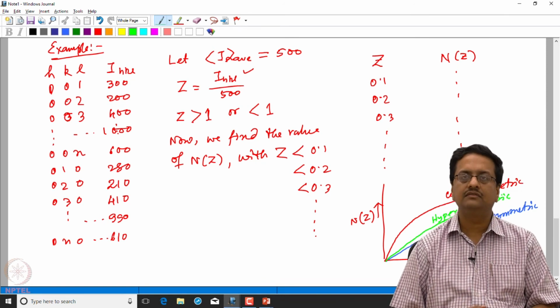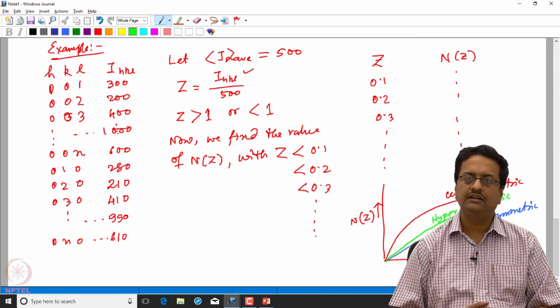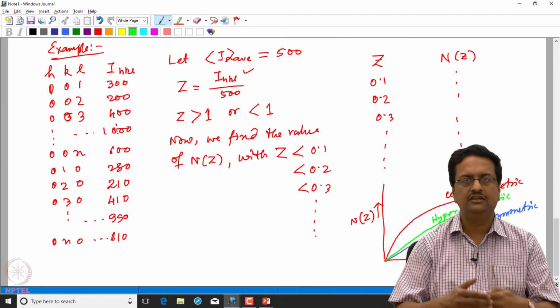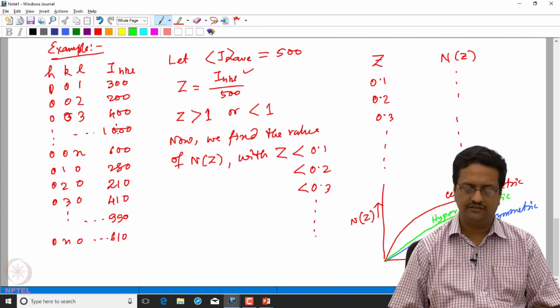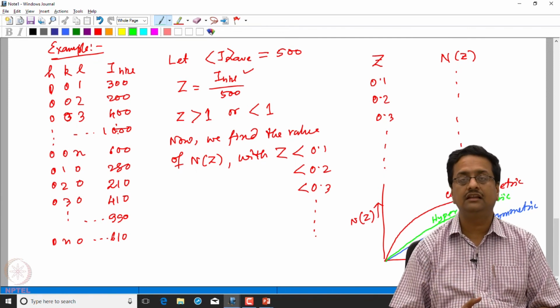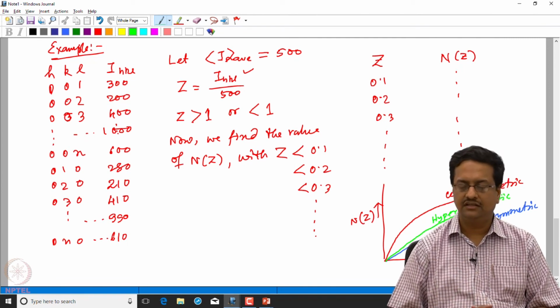So, in this lecture, we have learned how to identify from the intensity statistics the correct unit cell parameters, how to identify the correct Bravais lattice, that is the correct crystal system, whether it is monoclinic, orthorhombic or tetragonal or anything of higher symmetry, and then we tried to understand how one can identify the presence of an inversion center in a crystal. So, in the next lecture, we will discuss the study of these HKL IHKL values, from which we can then identify the presence of two-fold and mirror symmetry in crystal structures.